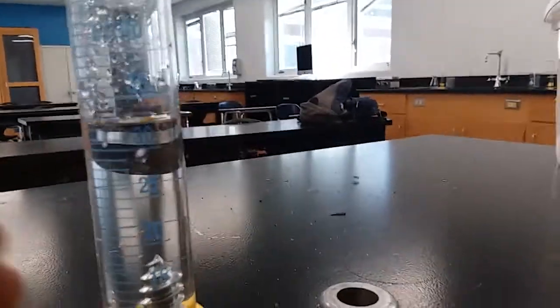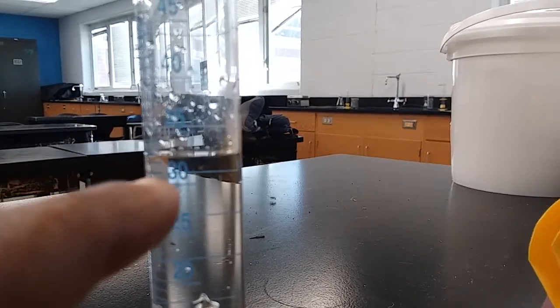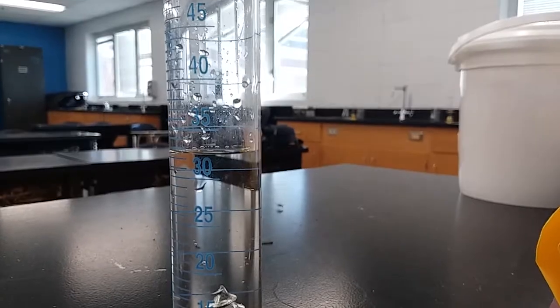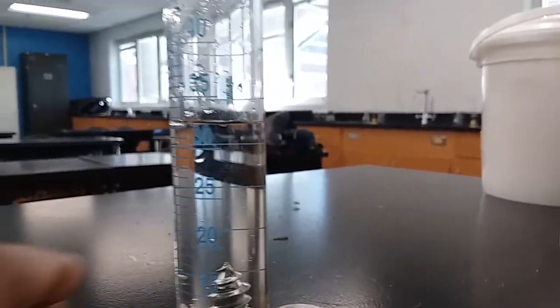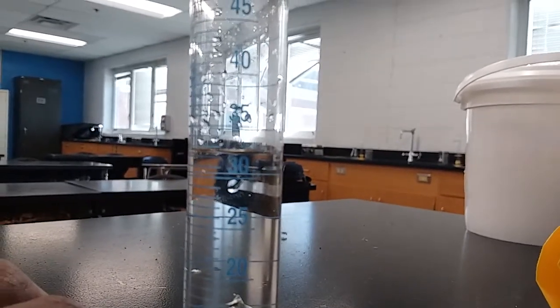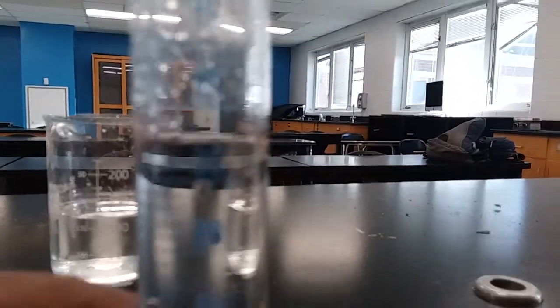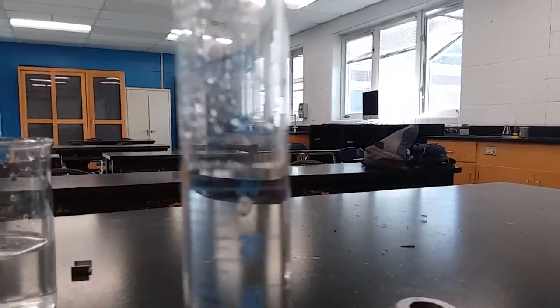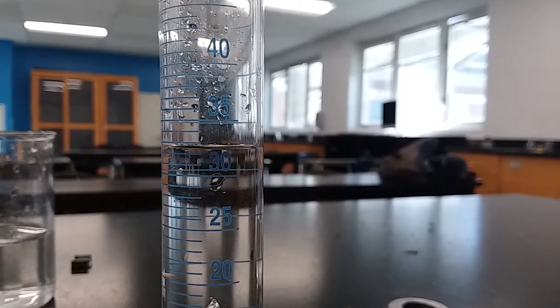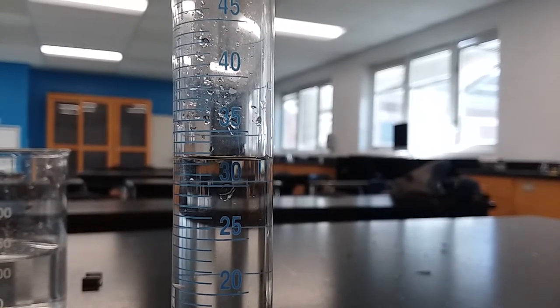So if I look at the increments on the graduated cylinder, I see that here's 30, and then 5 notches above is 35, so this one's going by ones. So we have about, it's kind of hard to see. There we go. So we could call that 31, 32 and a half.